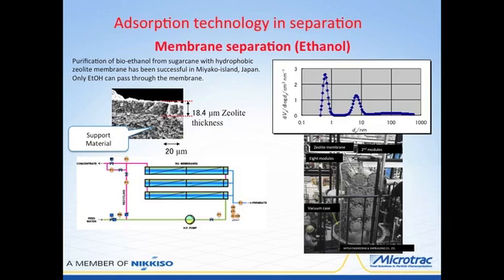Using the Bell instrument under a single condition of measuring both micropores and mesopores, and I'll explain a little bit more about that, we can see that down here below 2 nanometers, this does have a micropore structure. It also has a mesopore structure lying between 2 and 50 nanometers. And then there's some evidence of some macropores out here.